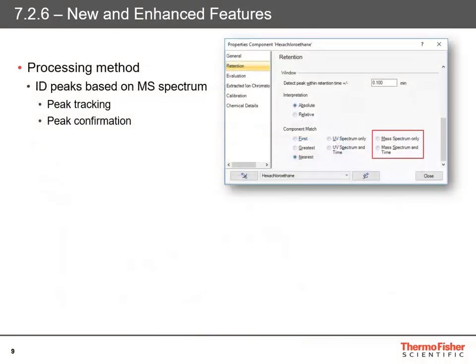Quite a few features in this release are for mass spectrometry, especially with the release of the ISQ EC. You can now use mass spectra to do peak tracking and peak confirmation. As previously with the peak component match using the UV spectrum, you can now pick a mass spectrum, look for it in your chromatogram, and track and confirm your peaks via the mass spectrum.